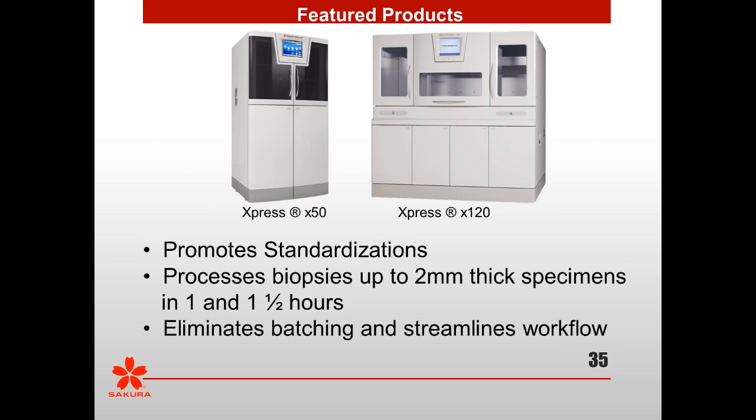Well, my recommendation is that you spend time up front in your process, and you'll have less opportunity or need to reprocess. I'll give you my experience with the Express and reprocessing. Again, the Express only has an alcoholic formula and paraffin on it. You want to remove your paraffin, and there are a variety of ways, but you only want to take it back as far as you need to in your process.